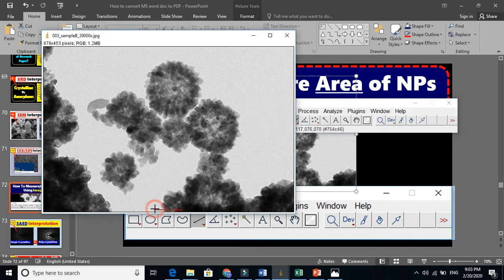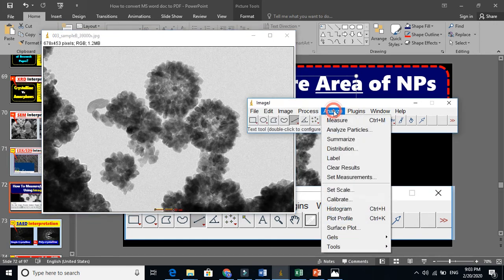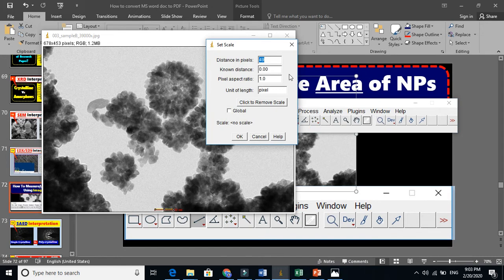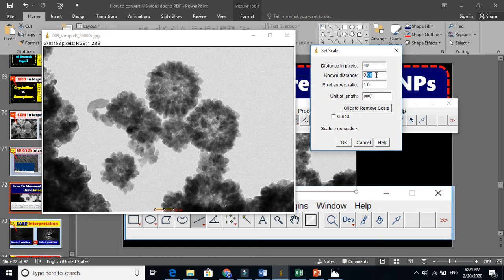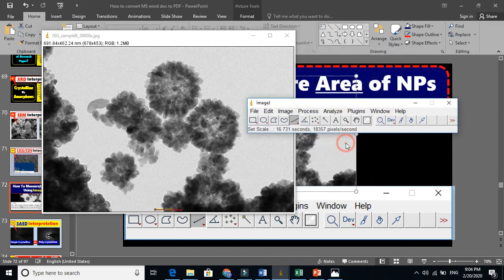So ImageJ can know that this bar represents 50 nanometers. Now go to Analyze and set scale. This is very important. The known distance I am telling ImageJ is 50 nanometers because this scale is 50 nanometers, and the units are in nanometers.